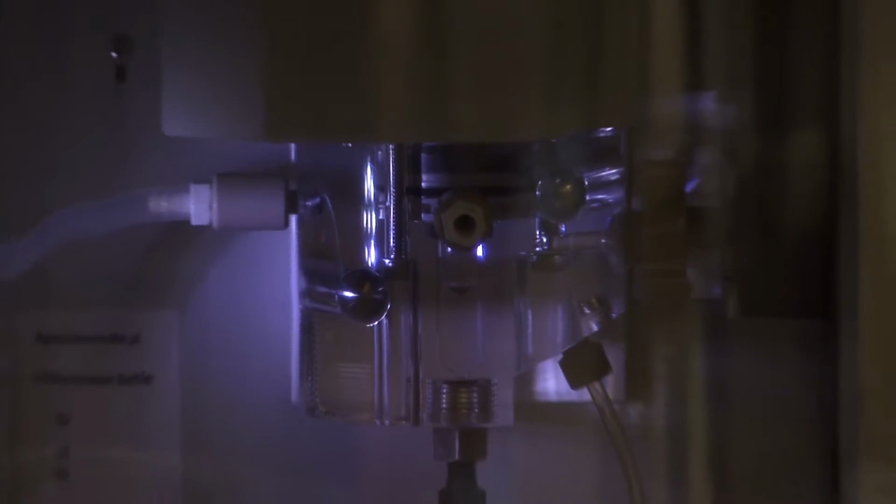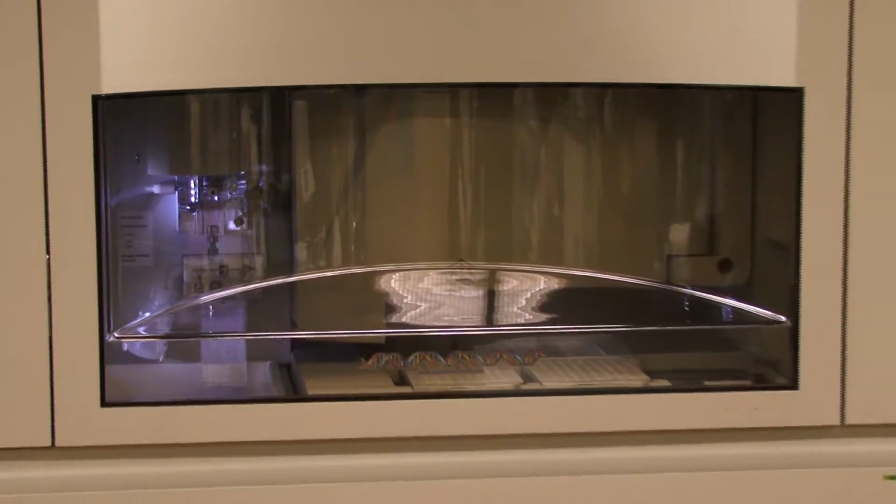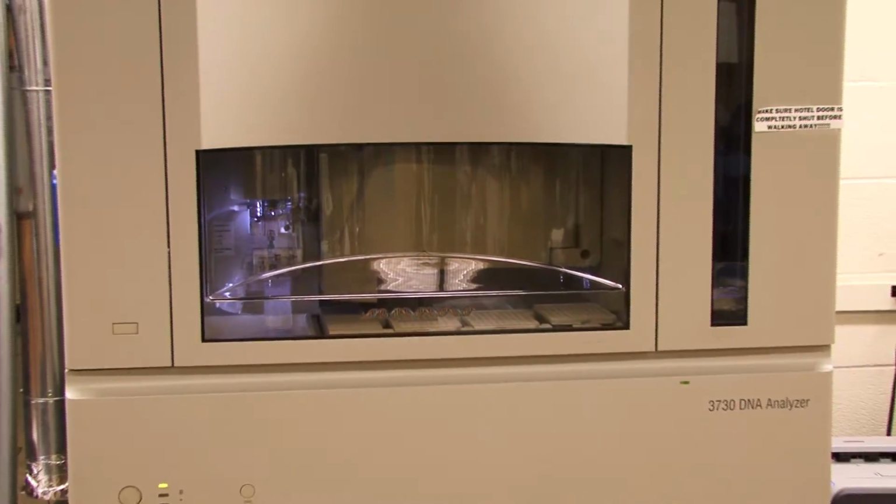As you might expect, along with big advances in instrumentation come corresponding demands on data management strategies. Data from the older instrumentation can be archived in the lab. So the data life cycle varies considerably from instrument to instrument. It basically depends upon the file output size. Now the data acquisition computer from the one instrument, the 3730 DNA analyzer, is an Oracle database. It needs to be periodically cleaned out, every 2 to 3 months. We have to dump this thing to clean it out to preserve room. Once the Oracle database is erased, all the raw data is gone.